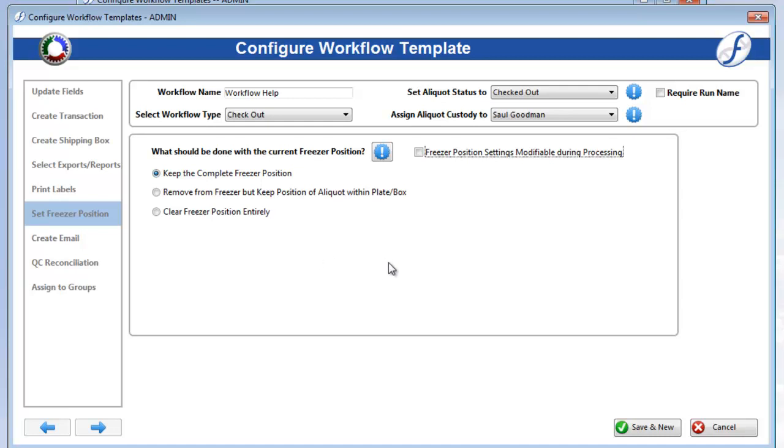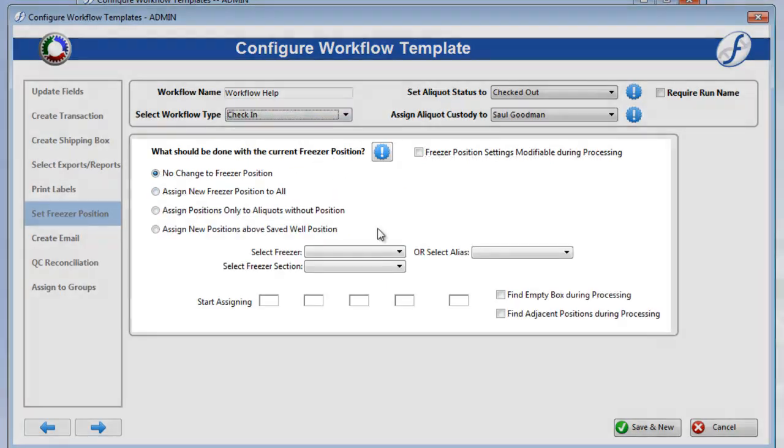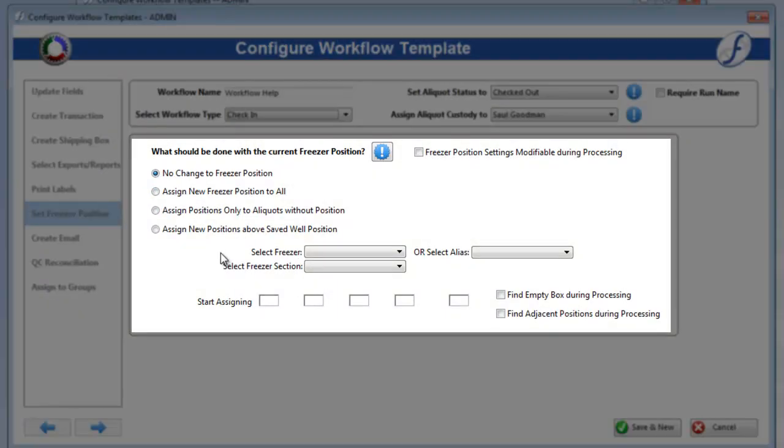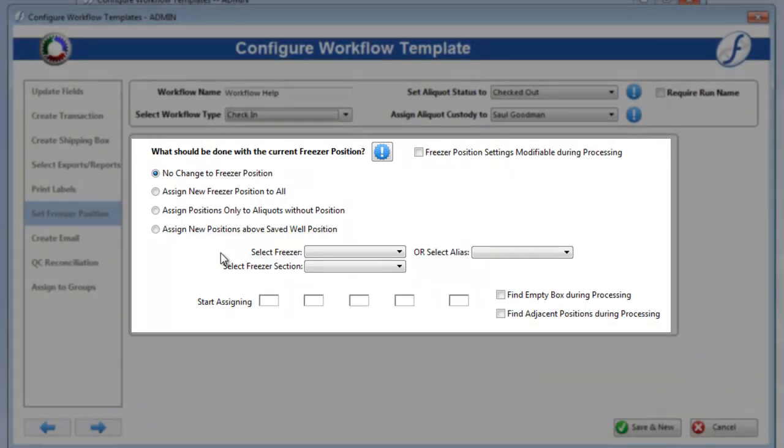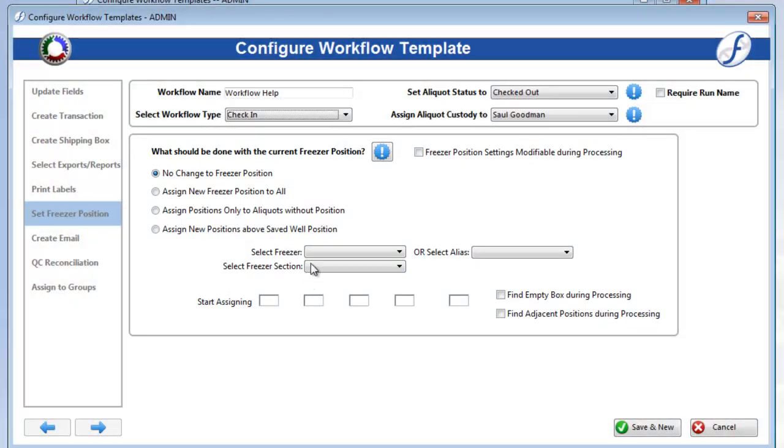On the other hand, check-in workflows have four options and include the Freezer Assignment fields to use when selecting anything other than No Change to Freezer Position.